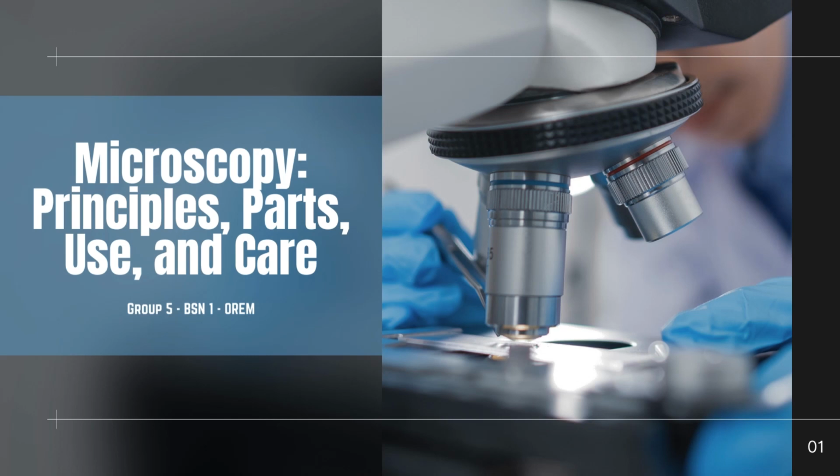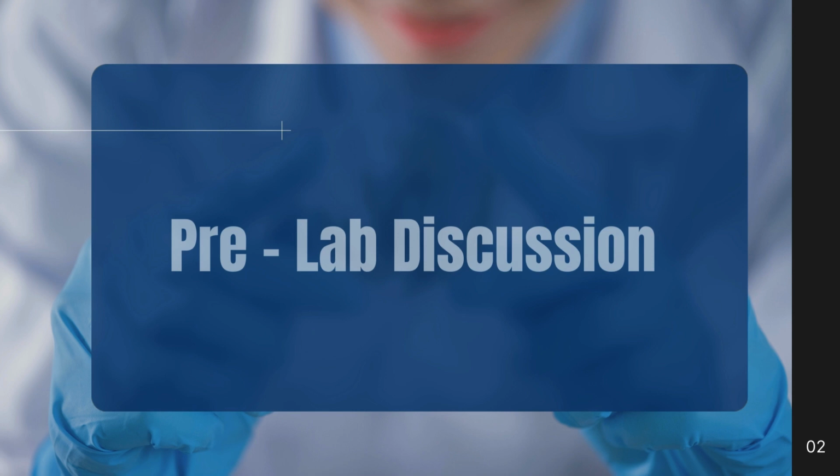Good day, everyone. Today, we are going to discuss the microscope with emphasis on its principle, parts, use, and care. Let's start by answering the pre-lab discussion.